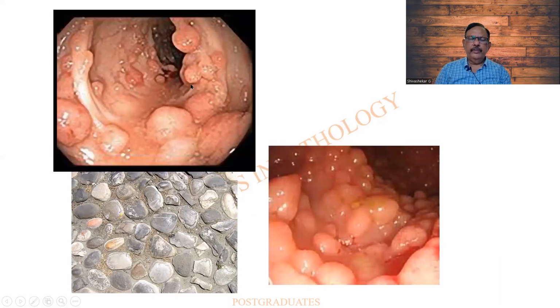The endoscopist has another picture. So we will have to be in concordance with the endoscopist, the surgeon, the clinician, and the previous records of the patient. See what is seen over here.